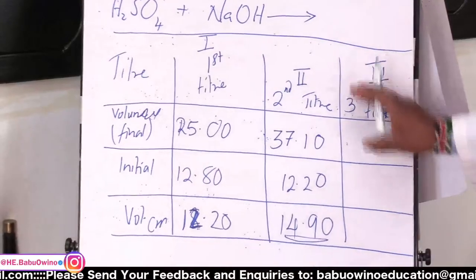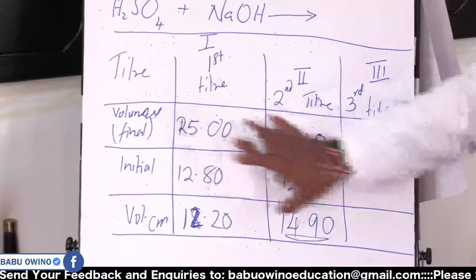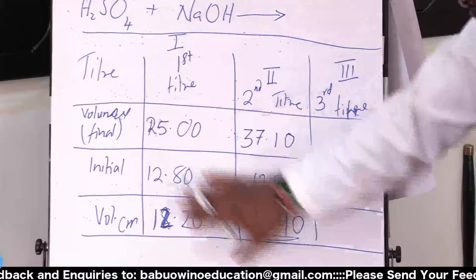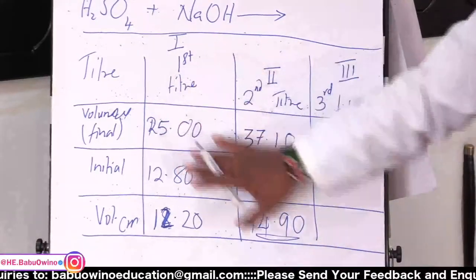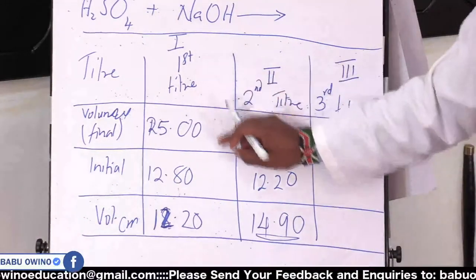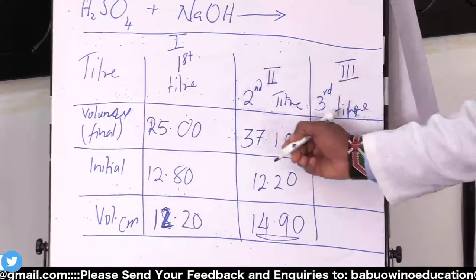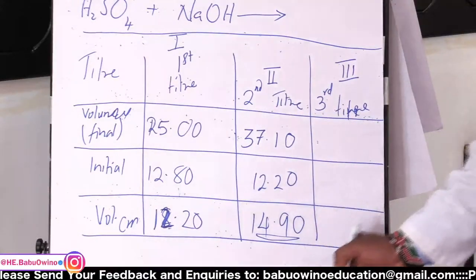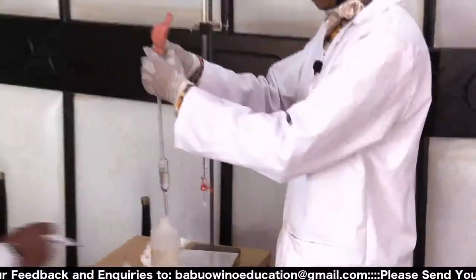And this is why it is important, therefore, to avoid these mistakes. We are doing this one to show you some of the things that you do. But when you do this, it's an indication that you are wrong. So how do you avoid this? From the word go, when you are starting, you ensure that you rinse your apparatus carefully and you run your solutions from the start, drop by drop. Let us now see what we do with this other one.